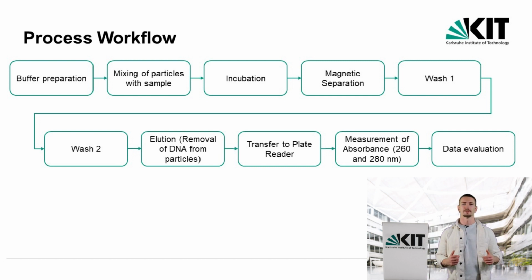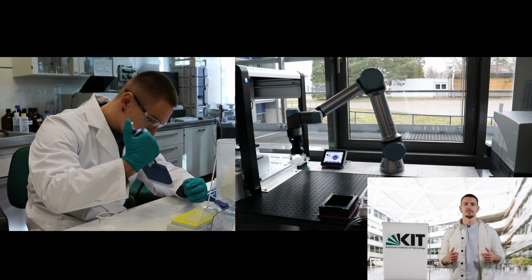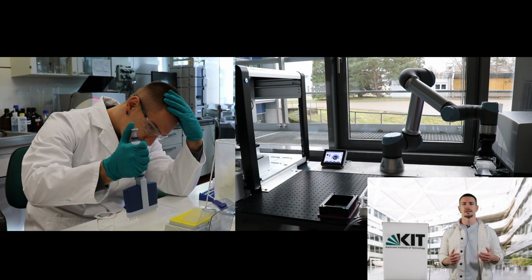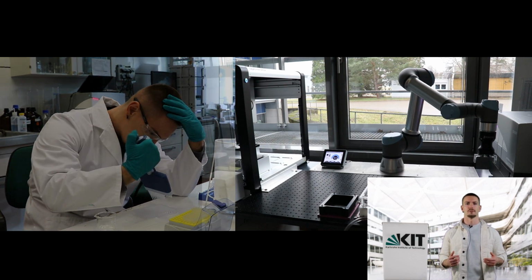The manual particle production is a very tedious and time-intensive task. Due to the many repetitive steps, it is highly error-prone and fatigues the scientist. To relieve the scientist, avoid any errors and drastically speed up the development time, we automated the whole lab.